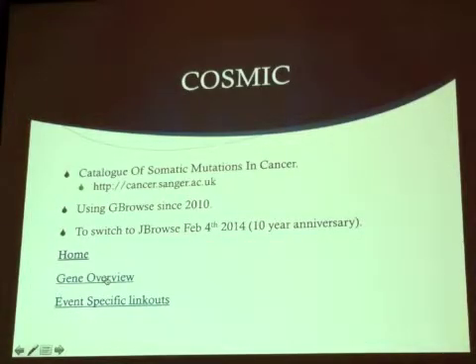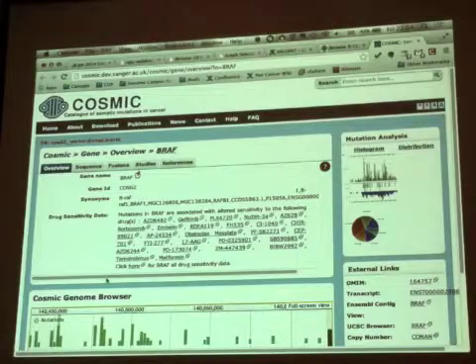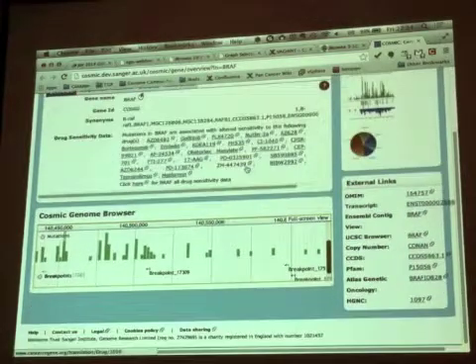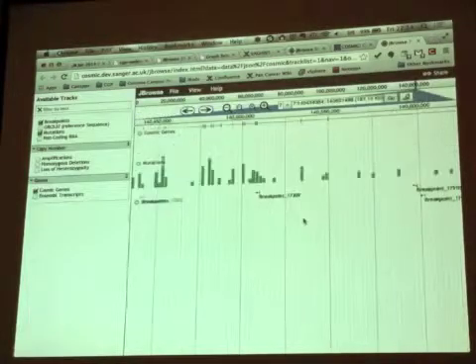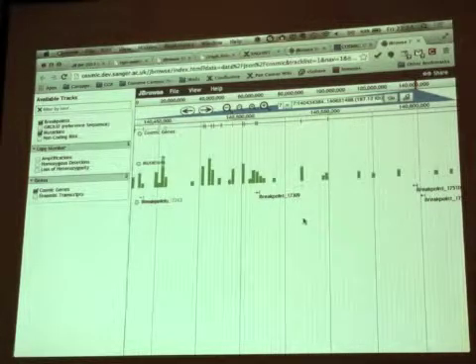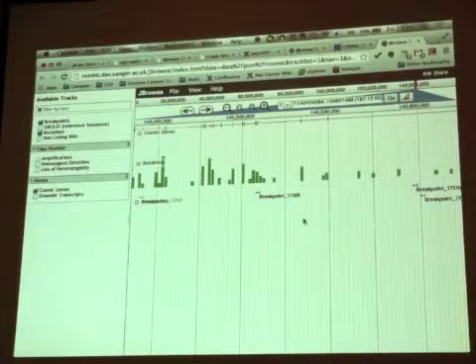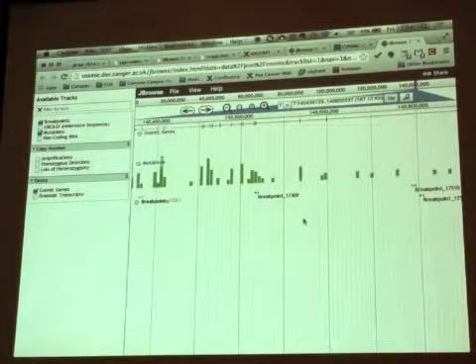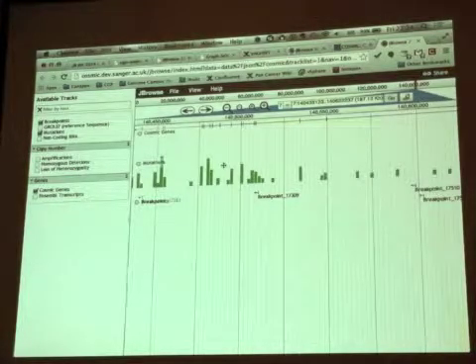However, it's also directly integrated, in the aspect that if you go in by gene name, you go straight to the region in the viewer for that specific gene, and you can see all the data. I'm a developer of these tools, so don't ask me too much about the data. But obviously, I'm sure everybody's seen JBrowse and has an idea how it works.